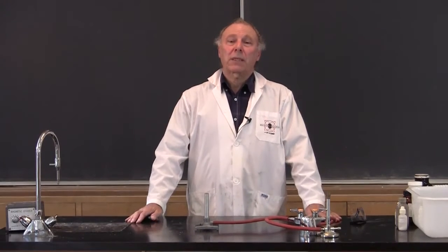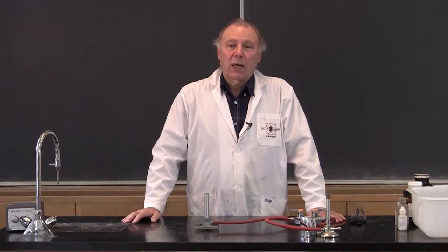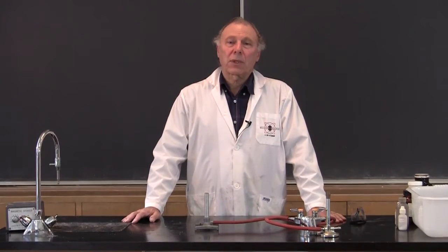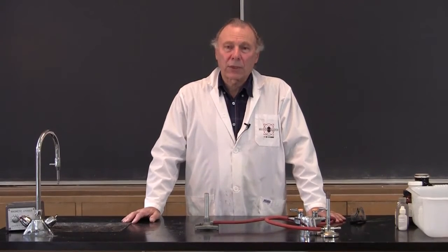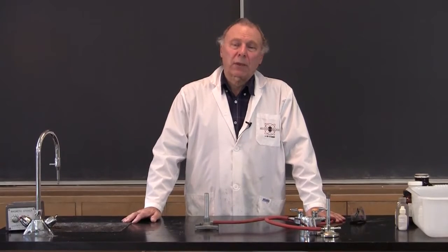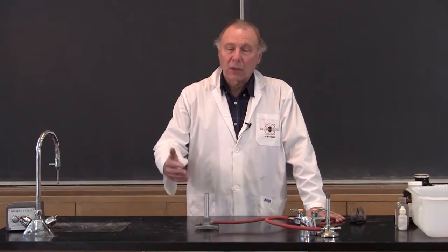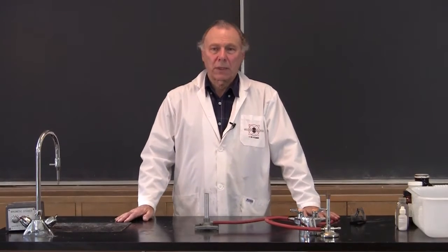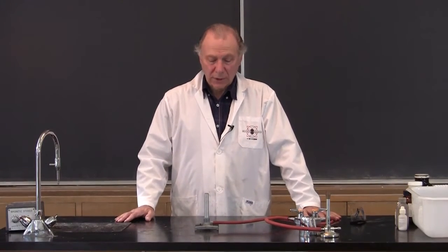Now, flame tests in the junior grades are important to show that certain metals give off characteristic colors, and through those colors they can be used for identification. In upper grades, when you talk about the formation of light by electron transitions, this is also a good illustration to show how color is formed by these electron transitions.